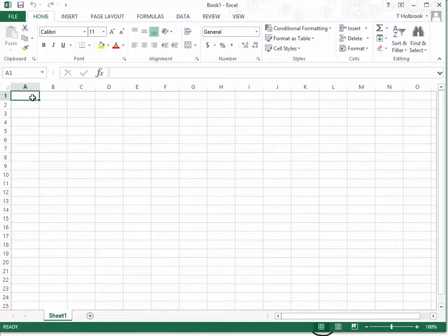So with this lab in part 3, we will be using salt solutions. And we know what those salt solutions are. We said that they were 4, 8, 12, and 16%. So the very first thing that I do is key those concentrations into Excel in column A. So A1 is 4, A2 is 8, A3 is 12, and A4 is 16.